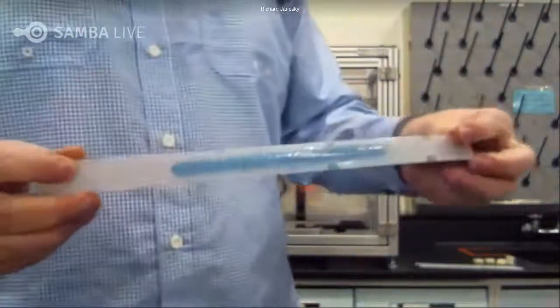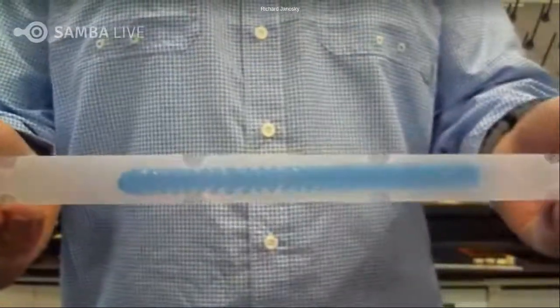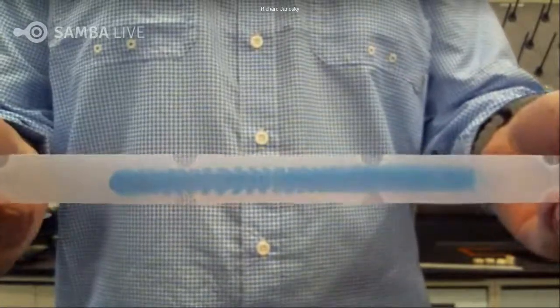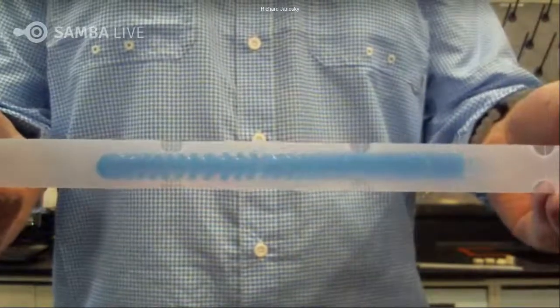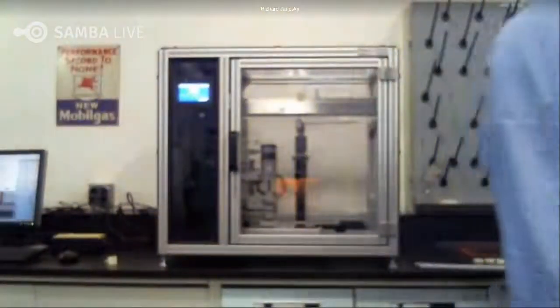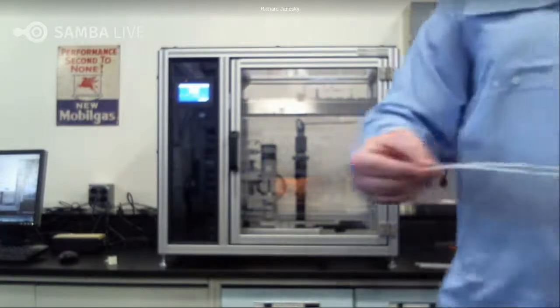Here, this is a brand new baseline. You'll see on the sides it has some toothing. This is due to the tackifier in the grease. This is an anomaly or something that we often see in brand new greases. And then I have some in-service greases to show you. And that'll show you the difference where they have a smoother profile because that tackifier is gone.